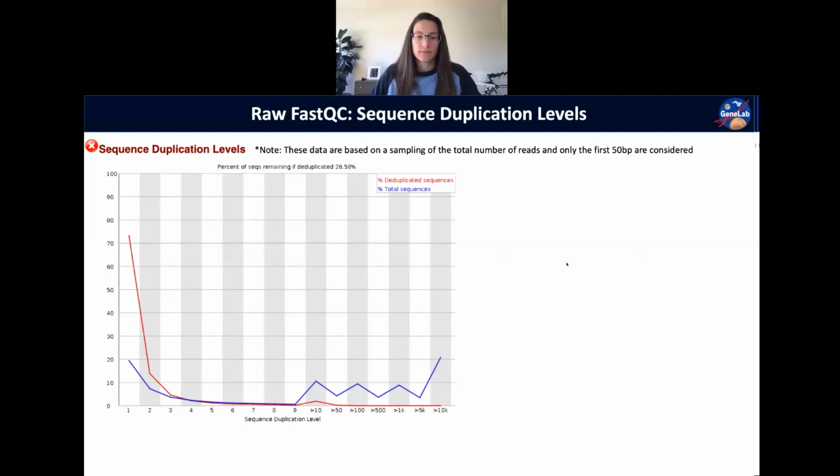It's supposed to be unbiased, but there always are some slight biases. So if you have multiple copies of a transcript, even though that cutting is supposed to happen randomly, it could cut a duplicate of a transcript in the same location, which will give you the same exact insert. That came from biology. That's called a biological duplicate.